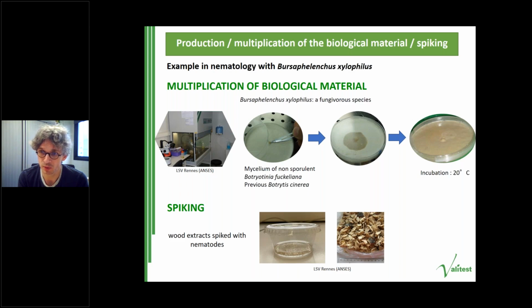Once you have your nematodes, you can just collect them and use them to spike, for example, wood, like shown on the picture at the bottom of the slide.